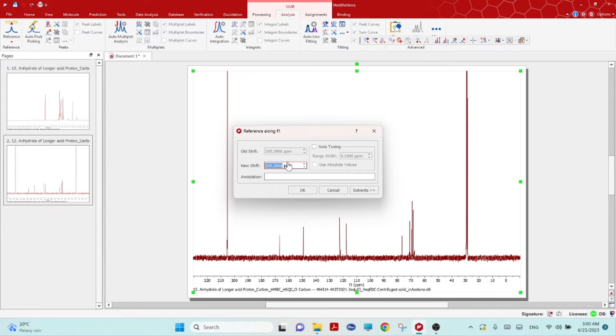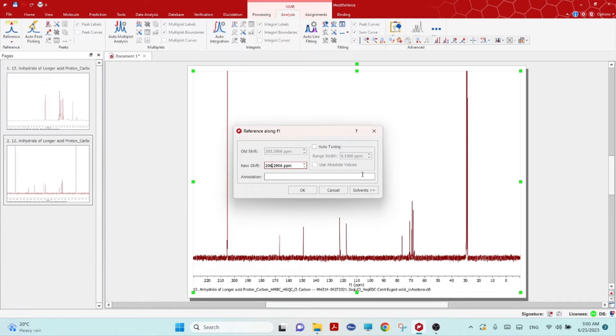Then reference, click reference and click on this peak because this carbon NMR carbon peak should be 206.3.